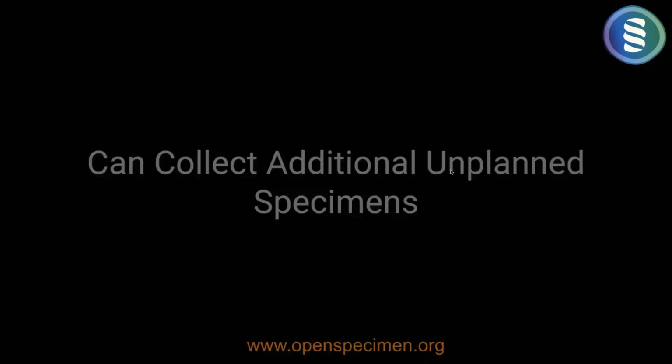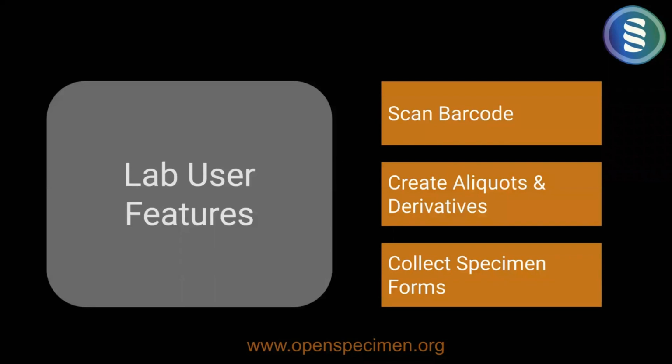You can also collect, obviously, additional unplanned specimens, and those are the kinds of things that you would do as a lab user, as a clinic user. So again, when we're differentiating between lab users and clinic users, I'm just taking that as an example or a real life use case. But in many of our customers' cases, all the data entry is done by the lab users. So there is no data entry that happens in the clinic.